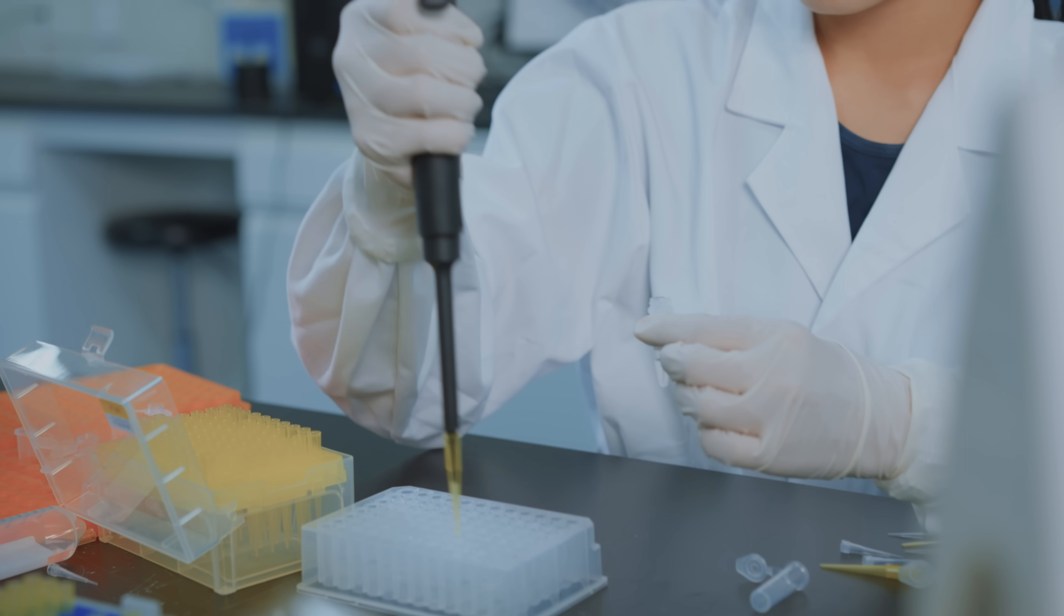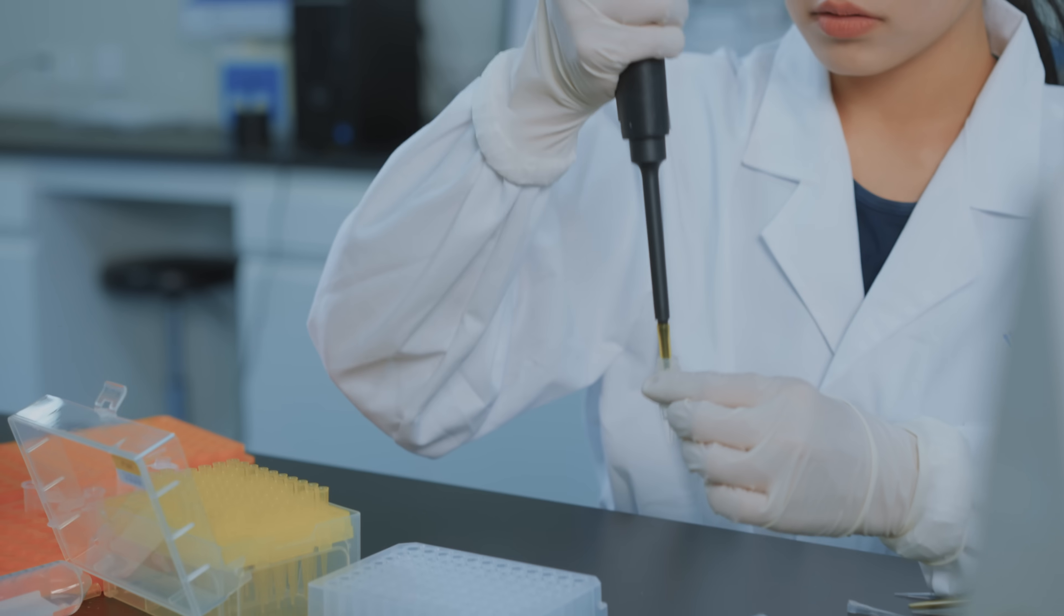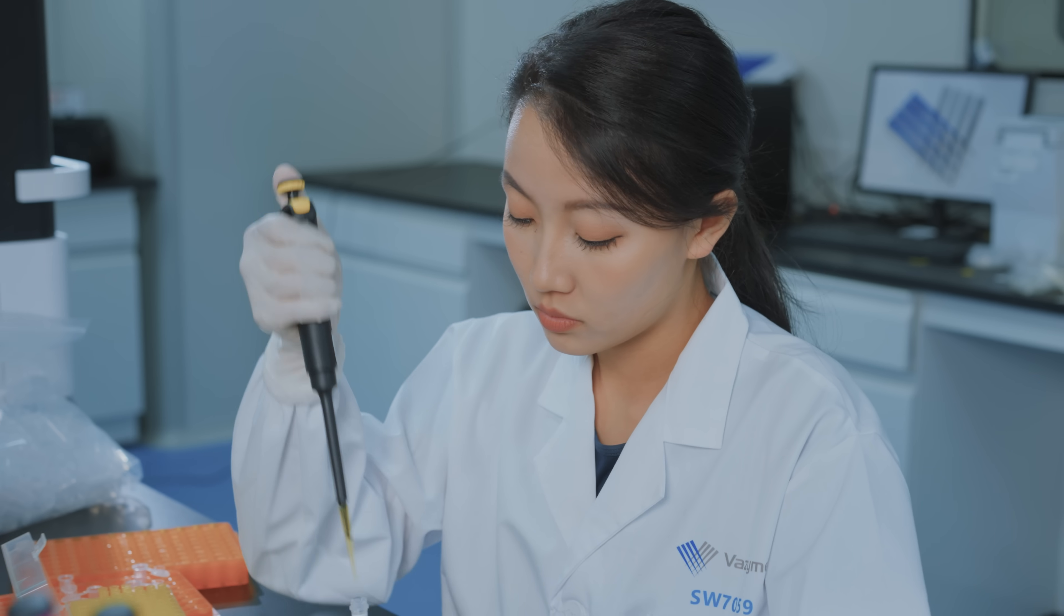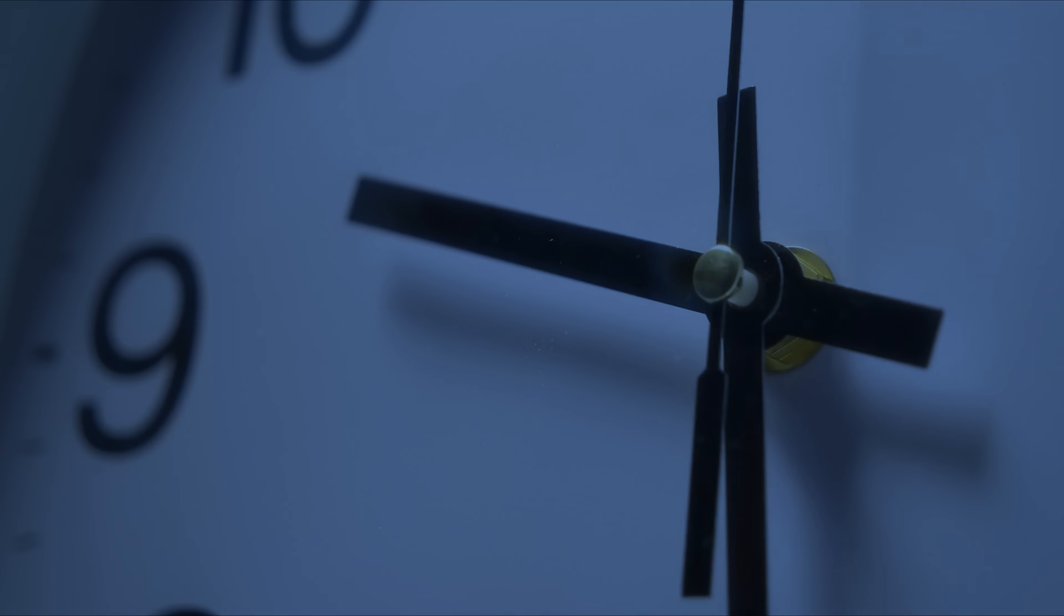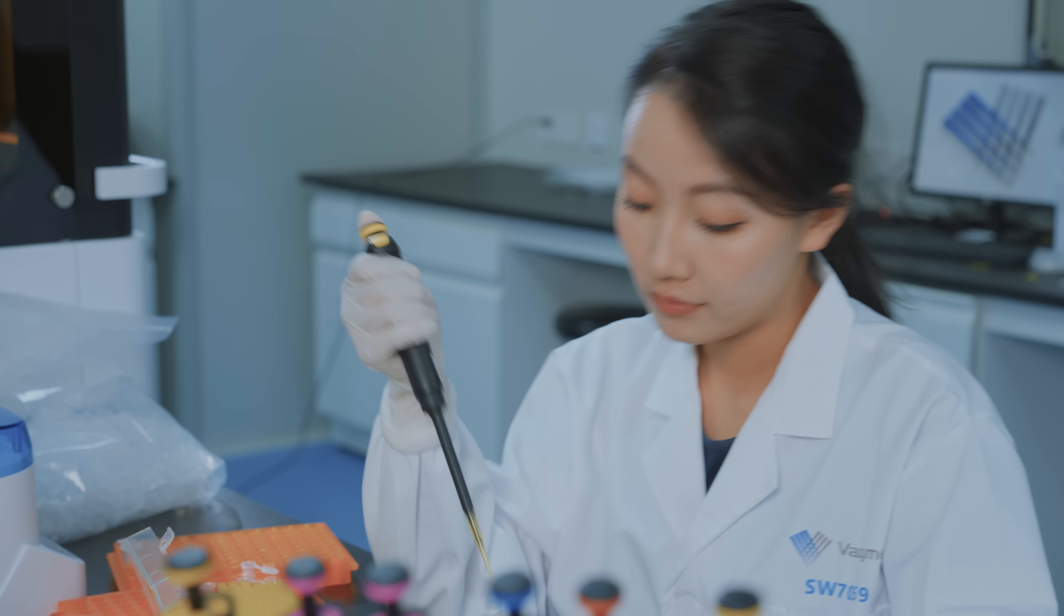Running late, mixing mistakes, errors are popping up everywhere. Yet here you are, endlessly pipetting away by hand.